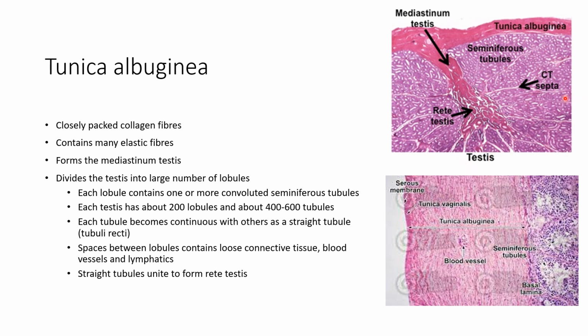You also have other things present within the space of each lobule. You have the loose connective tissue. You can see the connective tissue. You also have blood vessels, which we can't make out here, and of course you have lymphatics, and usually lymphatics flow alongside the same line of flow as the blood vessels.